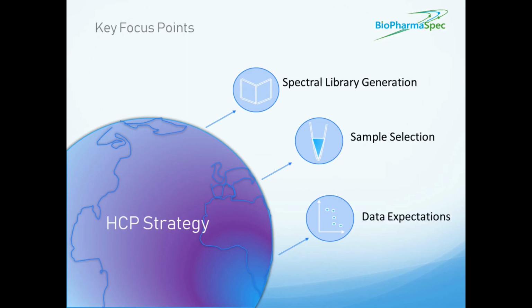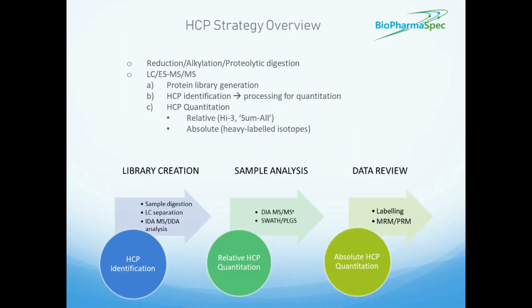And within these approaches, 3 areas that we think warrant the extra attention, and these include the spectral or protein library, the samples to select for the quantitative analysis, and the data quality or expectations based on the MS technique and the processing.